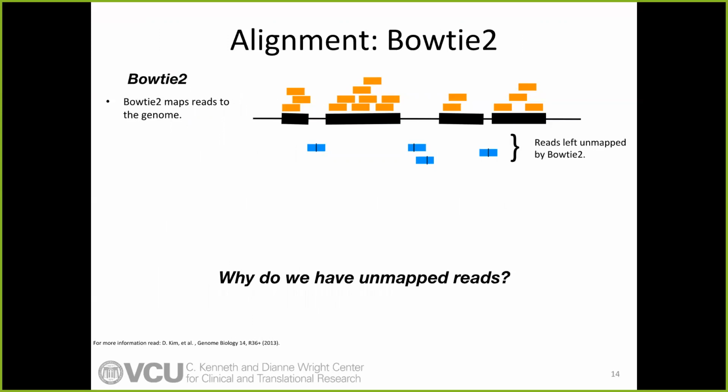Amy, one question. If you have microRNAs, these are like 25 nucleotides. Do you think at this instance, RNA-Seq won't be a good idea? For microRNAs, well, since you're sequencing the microRNA, it is RNA-Seq, but I think there are special methods that do the mapping for microRNAs. The length is like 25 nucleotides, so they're really short. So there are additional challenges with that.